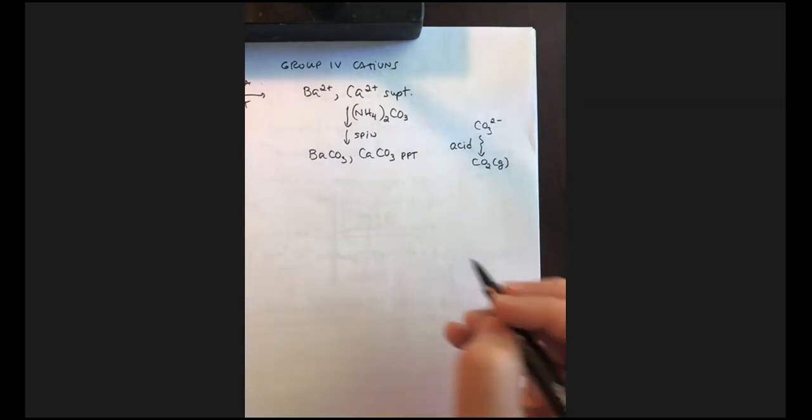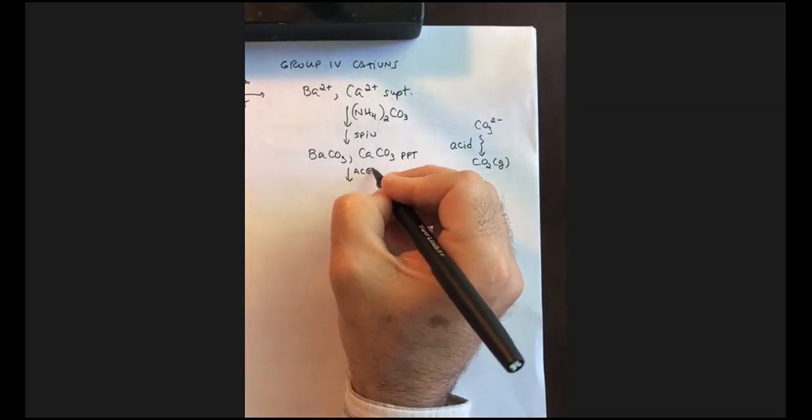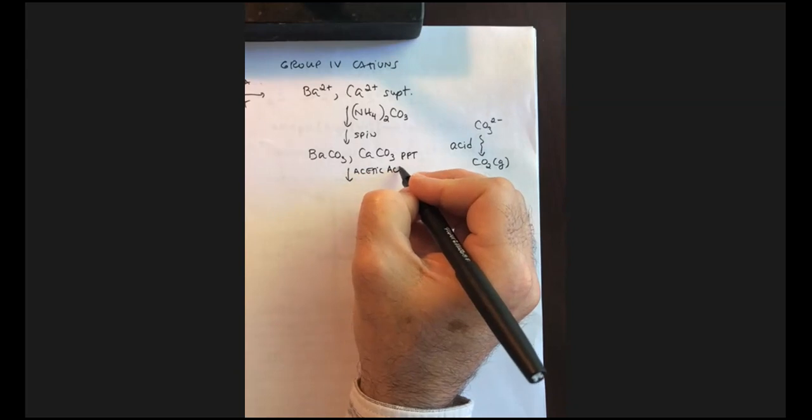Now, here's what we're going to do. We're not going to use just any acid. We're going to use acetic acid.